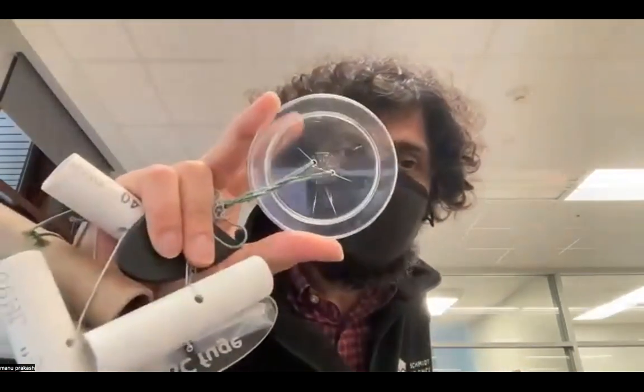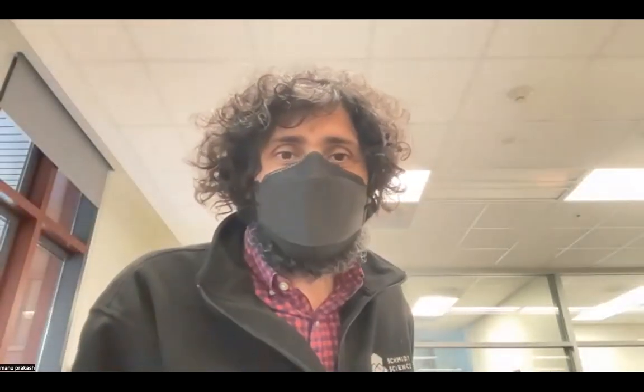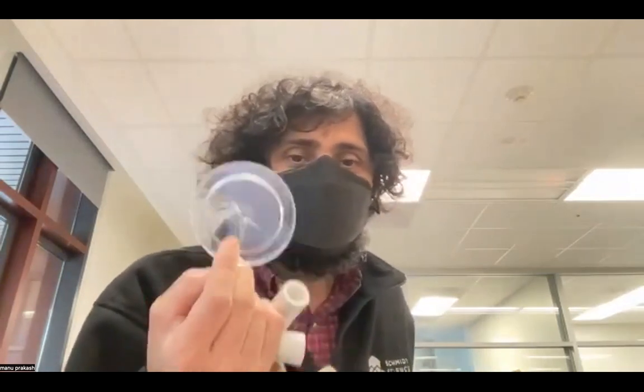If you go to your fridge, I'm sure you have some plastic bottles with caps. Drill some holes in it, find some thread or wool, and just make sure you can actually get the oscillatory rotation going in your own hands.